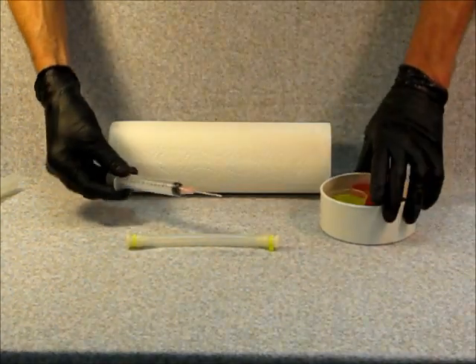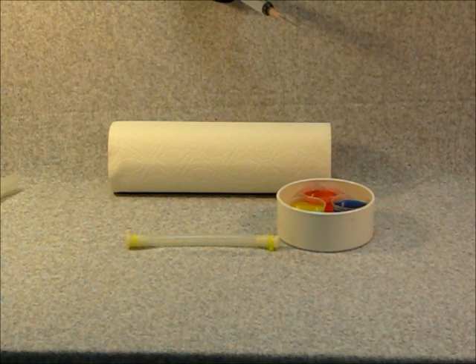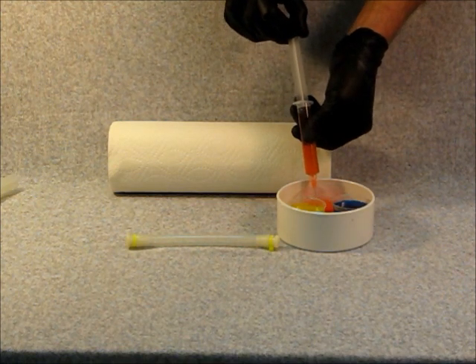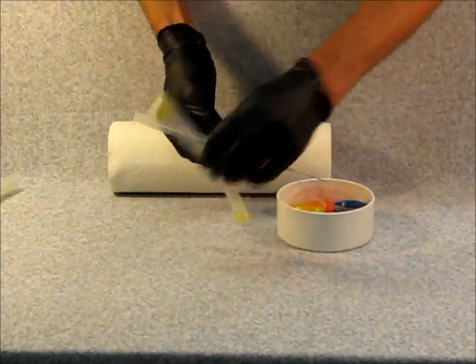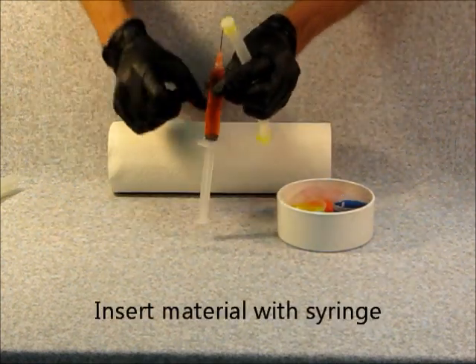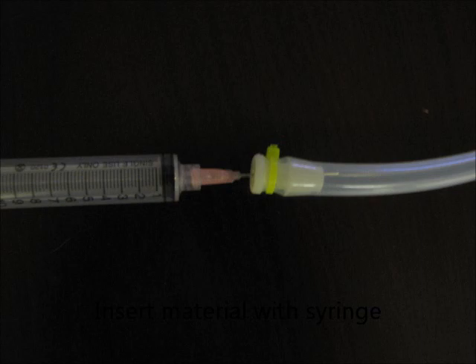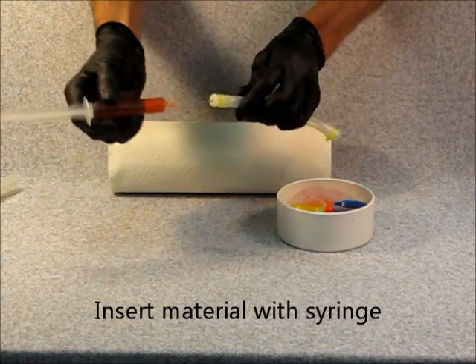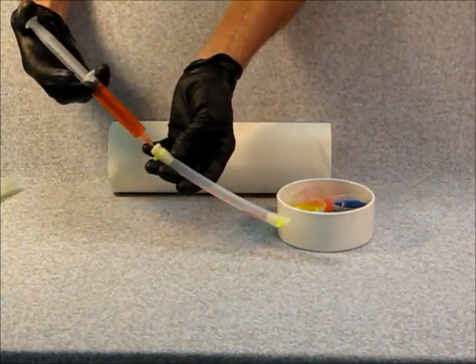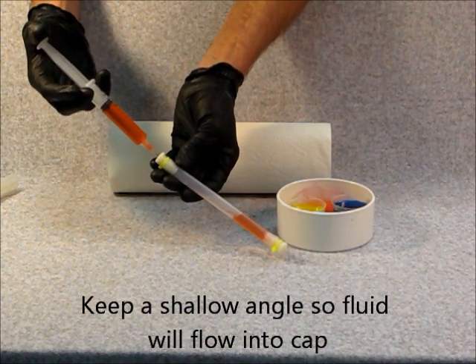You can now take your syringe with the industrial tip needle and use it to begin inserting material into the tube. Tap the syringe to remove any excess bubbles, and then insert it into the hole in the cap as shown. Keep the tube at a shallow angle so that the fluid will flow into the cap and not have any bubbles.